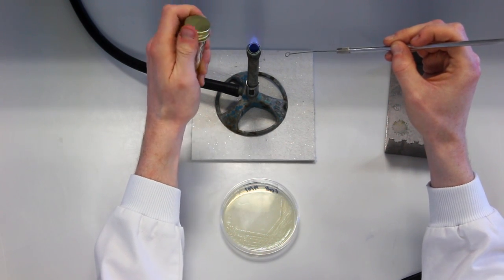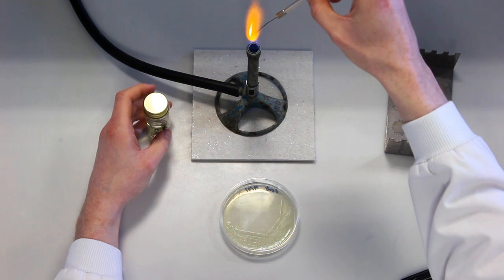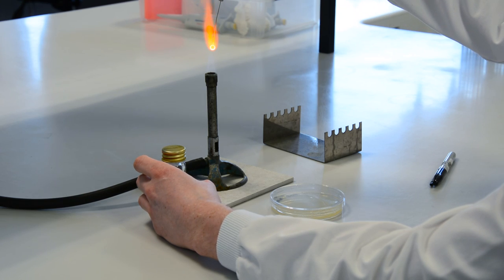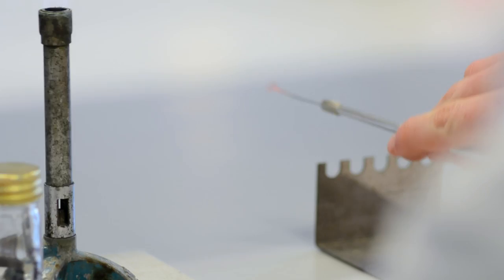The bottle neck is then flamed once more and the lid is replaced. Finally, the loop is sterilised so it is safe to leave on the bench.